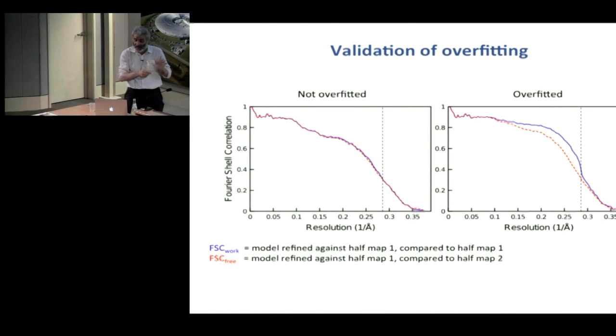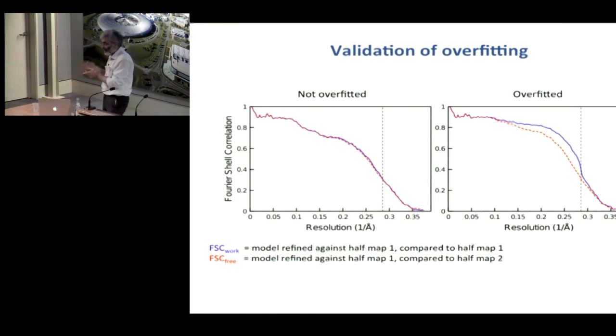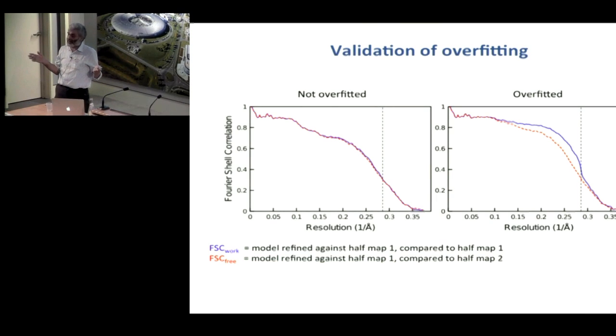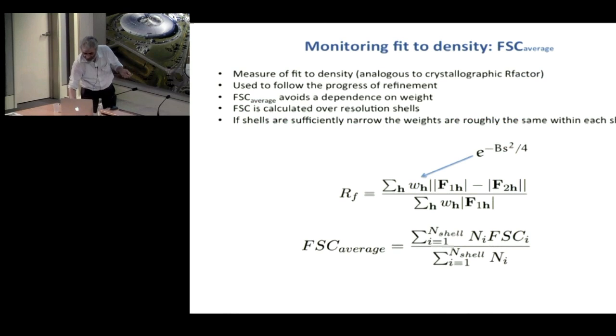And in principle and in general, it is impossible to remove all overfitting errors. We are dealing with statistical problems, and in statistics it's impossible to remove overfitting. There will be some overfitting, but you would like to have overfitting errors as small as possible. The only way of removing overfitting is not doing anything. If you don't do anything, then you will have no overfitting. But it's not good. You don't want that.